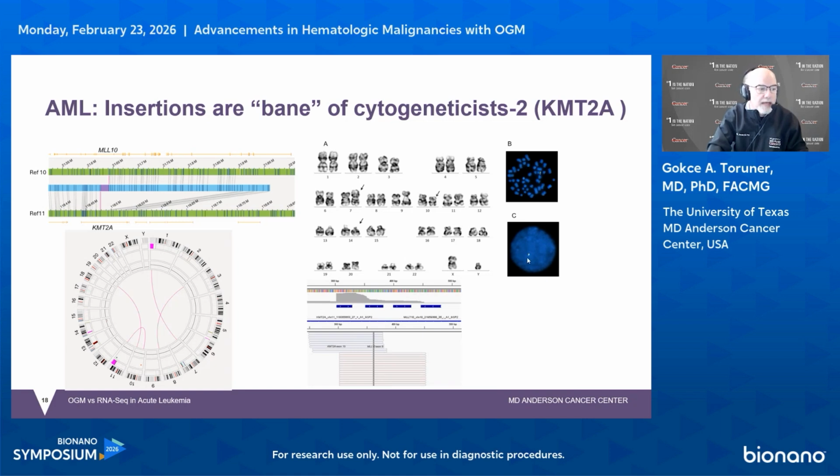And if you look at the fusion, what we have is an intact fusion signal. This is not consistent with a rearrangement whatsoever. But what is remarkable, though very hard to ascertain here, is that it was on chromosome 10.